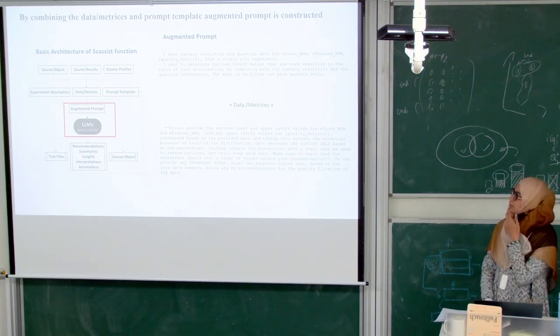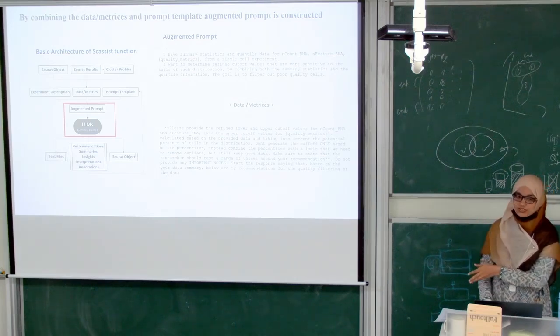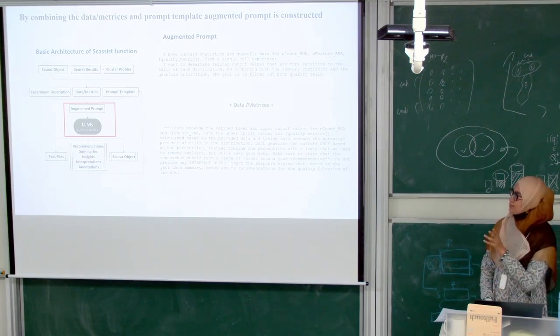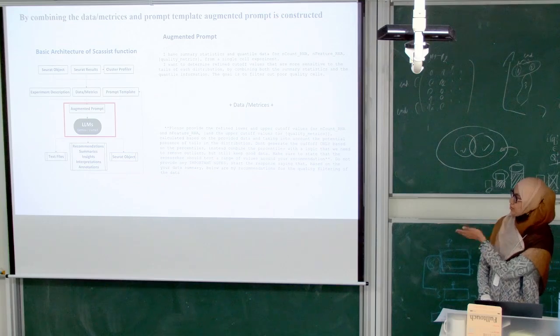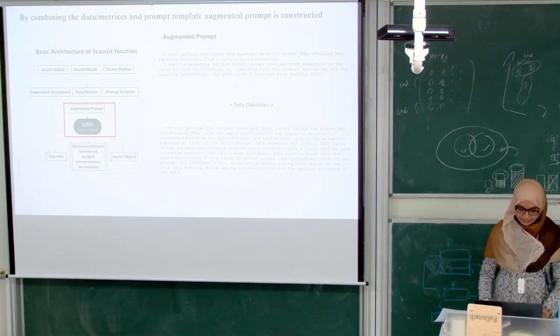This prompt is the input to the LLMs. On the basis of this, the LLM will give the recommendations. This includes the prompt and what they want to do, and the data or the matrices from the previous results.